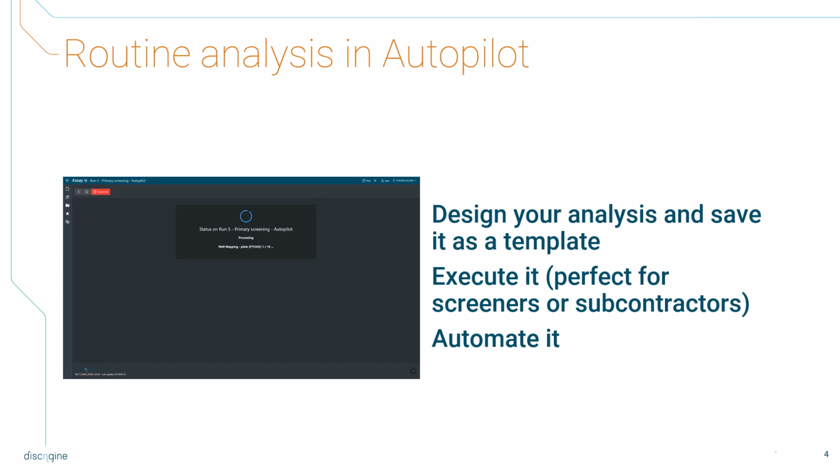We have shown how to perform an assay with the execution mode. You can also design your assays in design mode, save them as templates and execute them with execution mode as we did in the video, or even use them in the autopilot mode, where the assay will be run automatically.